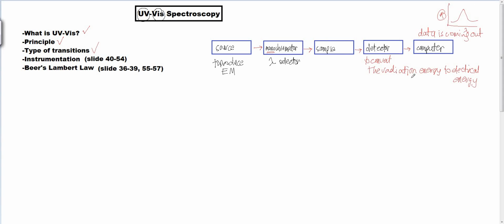Okay, so these are, we call it as the brief introduction on the components in the UV-Vis spectrometer. Okay, so kalau saya boleh pergi detail, for example, kalau kita kata kita start with the sources, kalau saya boleh lukis kat sini, for example, you have a light, okay, so usually the light that we are using, sama ada kita guna deuterium light.